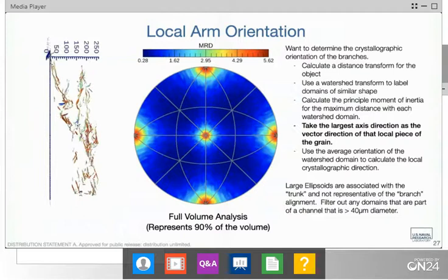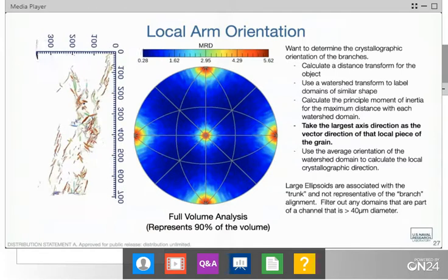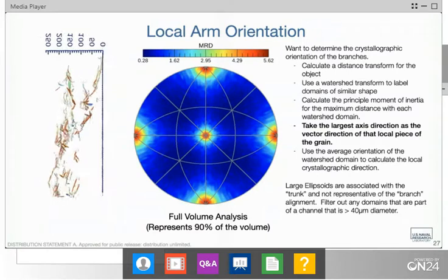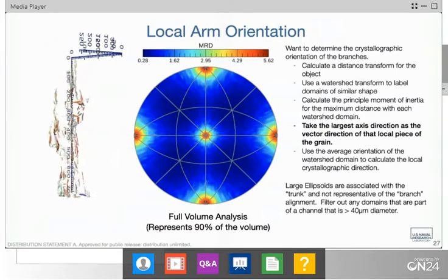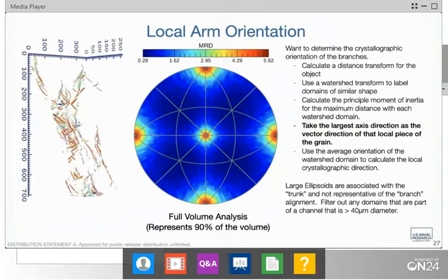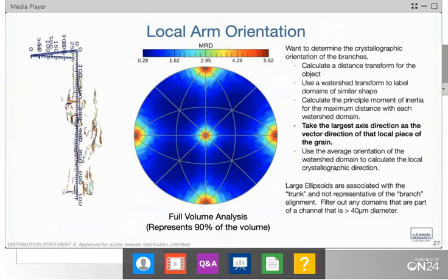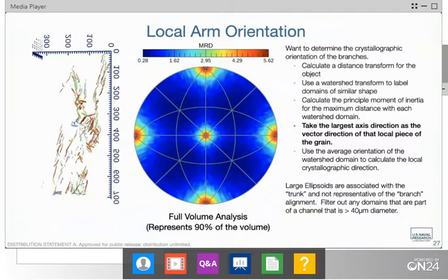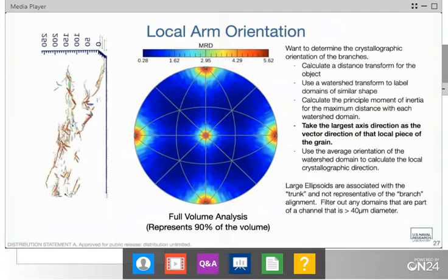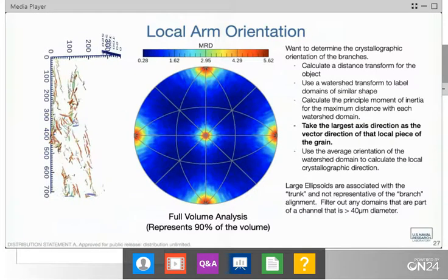Have we ever encountered unmolten powder particles that are partially or still martensitic? We have not seen any evidence of martensite in any of the reconstructions. We did use both the ferrite as well as an austenite phase for looking at the EBSD reconstruction. We also did some X-ray diffraction on the sample beforehand, and we saw no evidence of any BCC within there. Of all of the things that we saw that do look like unmelted powder particles, they still very much look like they are all austenitic. So even with these very rapid cooling rates, everything that we're seeing is austenitic.